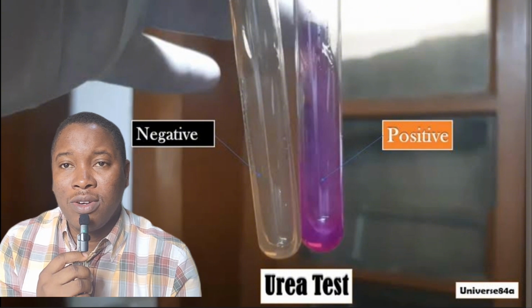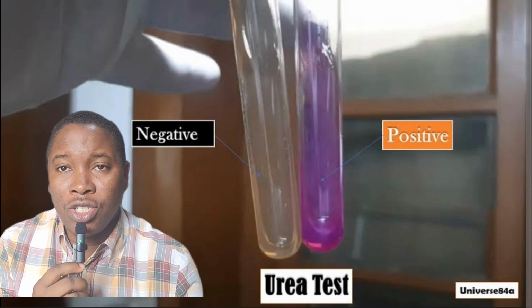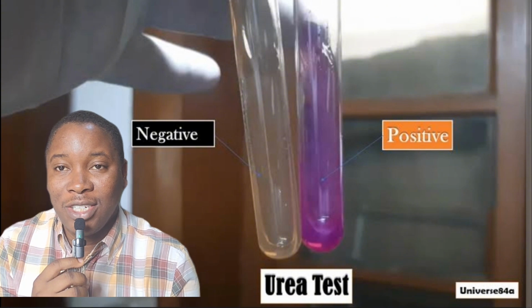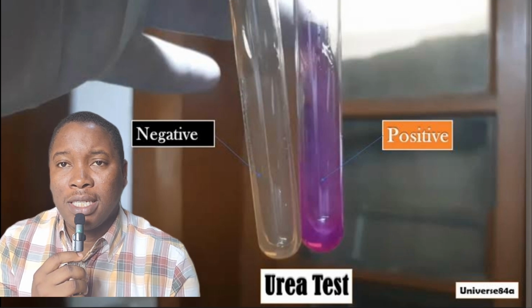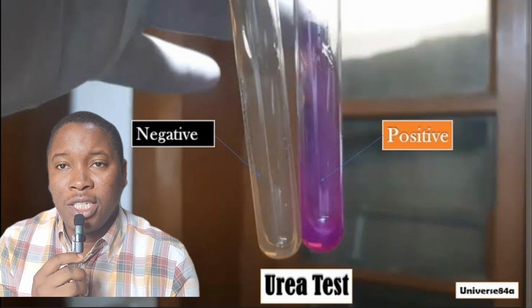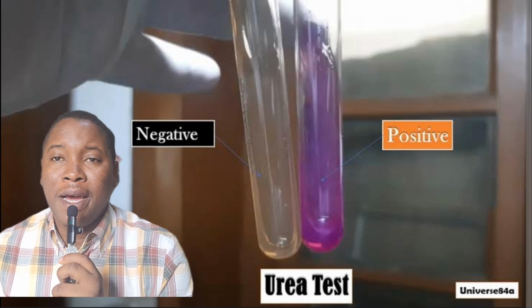All you need to do is create a kind of media that is acidic in nature, and then has an indicator. Many times we use phenol red, or whatever indicator you want, but an indicator that is able to show you a color change, so that when the pH changes from slightly acidic to slightly basic, you are able to identify it simply by a color change.